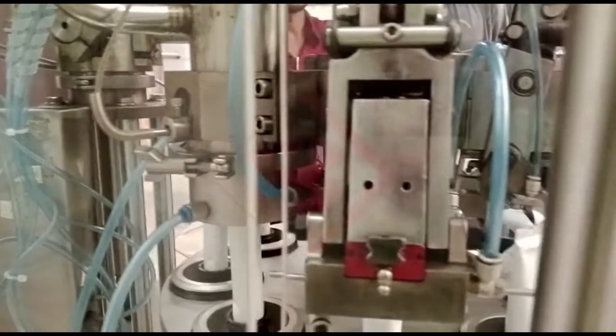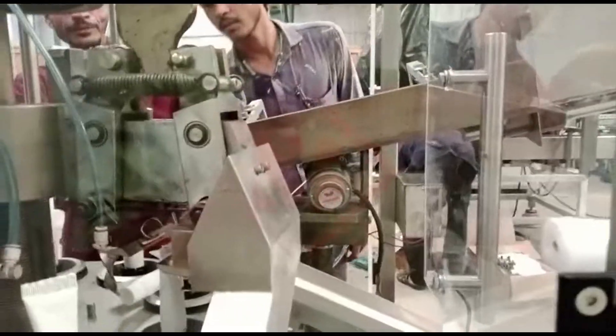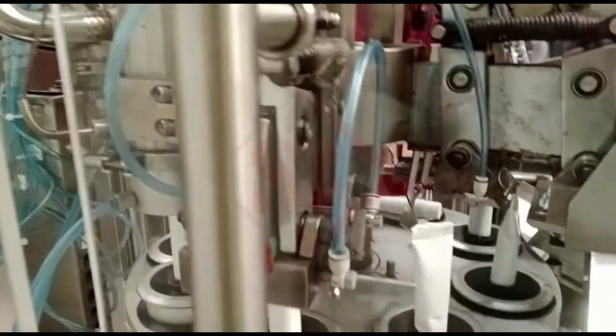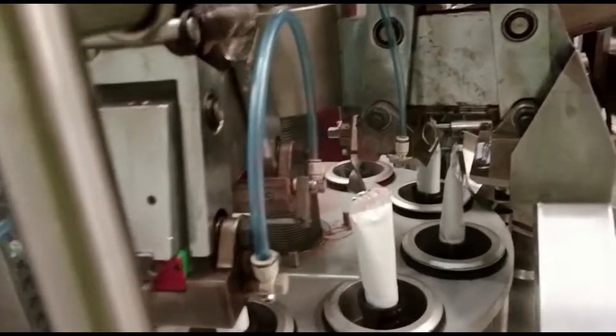Coding and Marking: Some tube filling sealing machines are equipped with coding and marking systems that allow for the printing of batch numbers, expiry dates, or other product-related information directly onto the tubes.